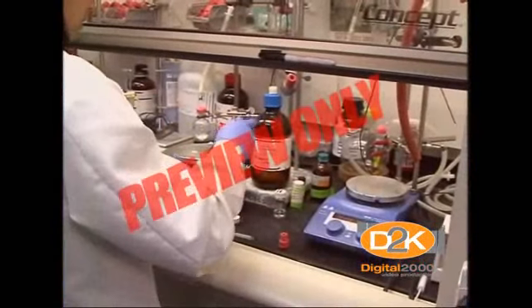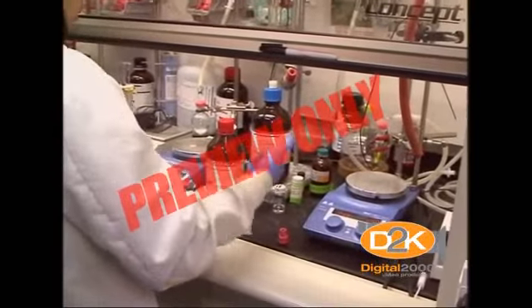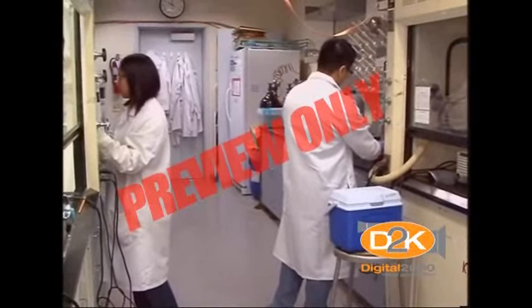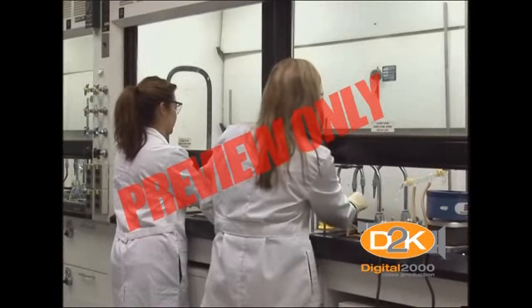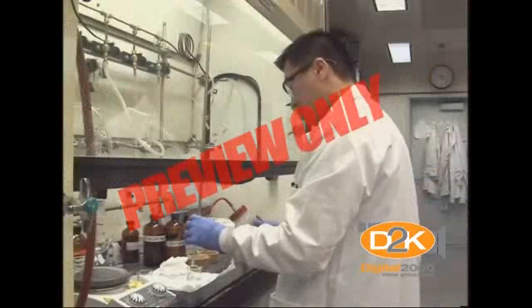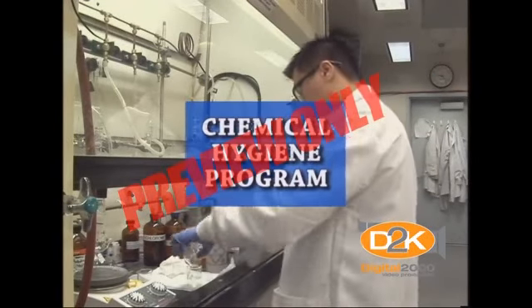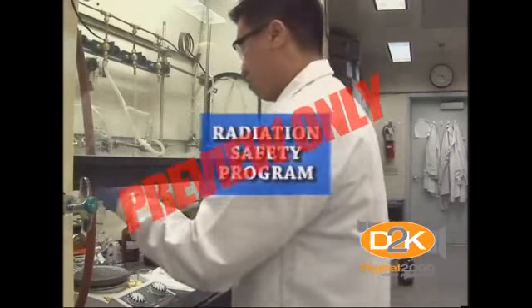Laboratory safety is a critical part of any university's safety program because there is so much information, so many people involved, and so many details to be learned. Of course, the underlying importance is educating you in the various science disciplines and how to work safely with chemicals. Your university's laboratory safety program is comprised of the chemical hygiene program, biological safety program, and radiation safety program, and possibly other topics.